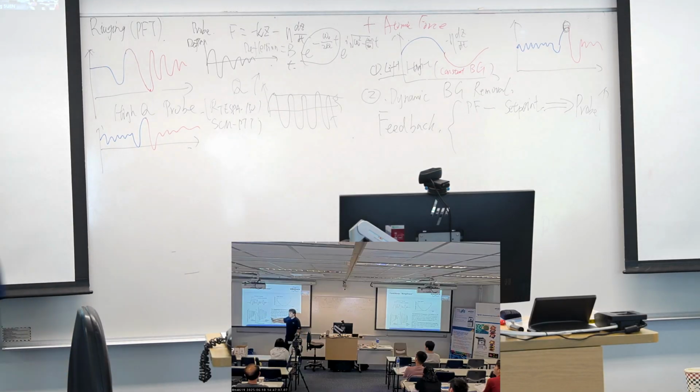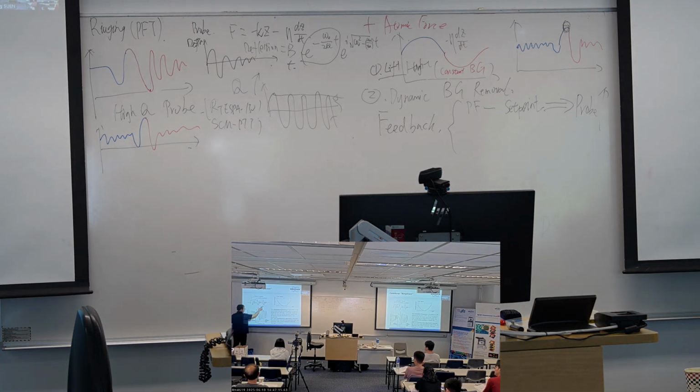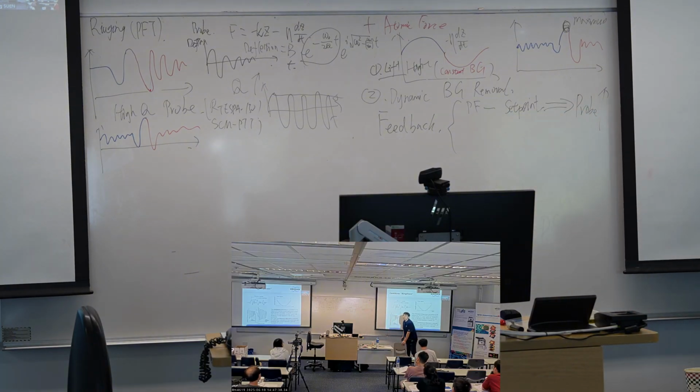in this ringing situation. Because the ringing is so strong, it can exceed the atomic force. So, for example, in this example, the maximum ringing force is really large, but the atomic force should be somewhere here. So it means we should not use the maximum inside one period. That's the problem here.